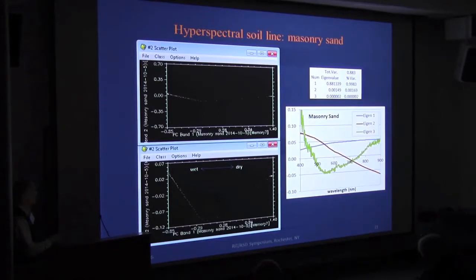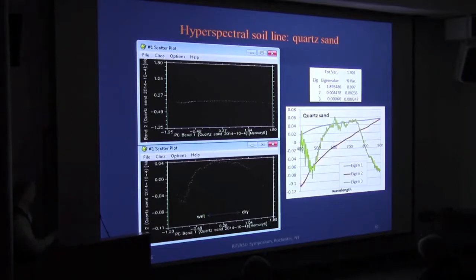And the third principal component, I'm going to pretend is not there because it explains so little data. But now, the second principal component, there's structure there. Something's going on. Something's changed right there. I don't know what that is, but there's something happening with that. The structure of the soil is different. This is almost two linear lengths. This one's a continuous curve. I have no idea what that difference is, what could cause it.